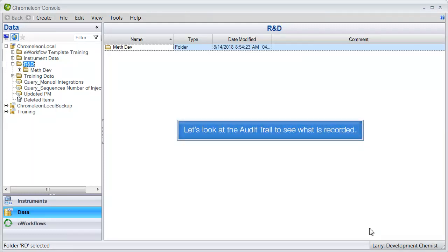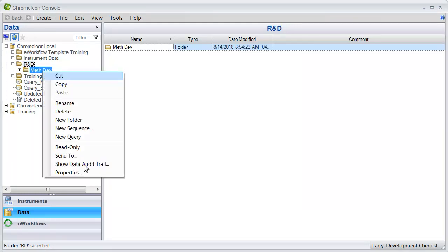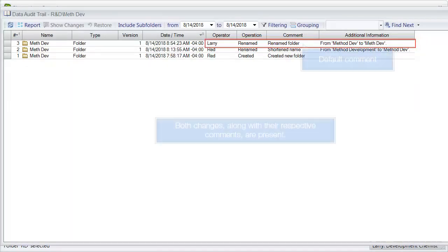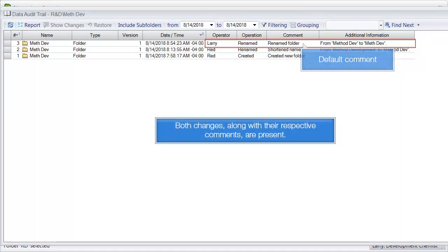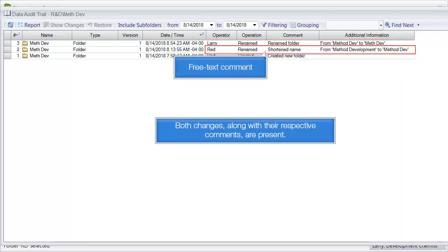Let's look at the audit trail to see what is recorded. Both changes, along with their respective comments, are present.